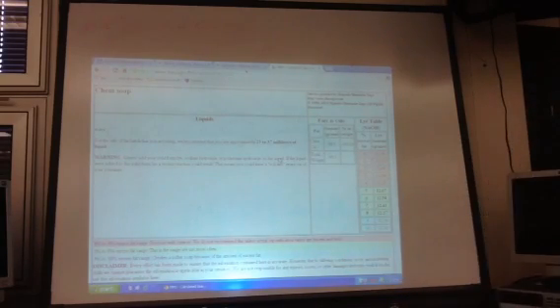Since we were using kind of incomplete formulas, we got about as close as we could expect. So with that, on your lab packet, on the front page where it says materials, if you look down at that list, olive oil, blank grams, you're going to use 98.5 grams of olive oil.